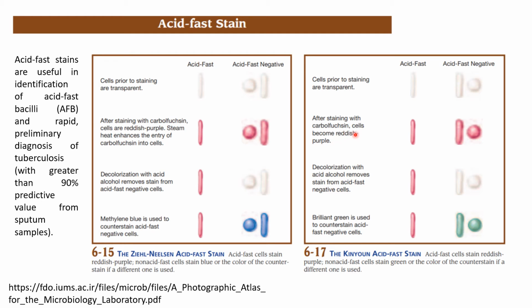However, Kinyoun doesn't use steam heat. Rather, they developed a more lipophilic or more lipid-soluble carbolfuchsin, so it can go inside the cell. Okay, so if we compare Ziehl-Neelsen and Kinyoun, it's better to do the Ziehl-Neelsen acid-fast stain rather than Kinyoun.